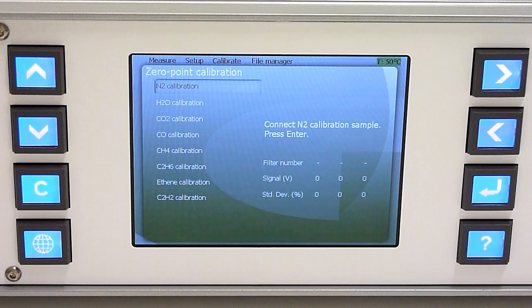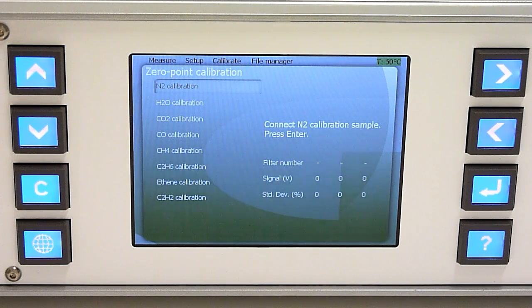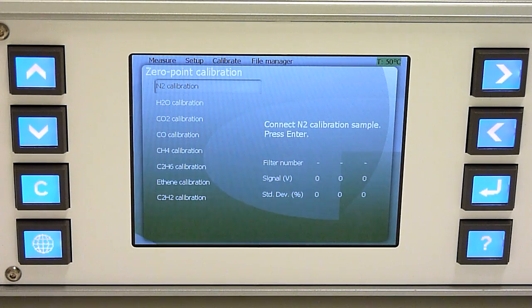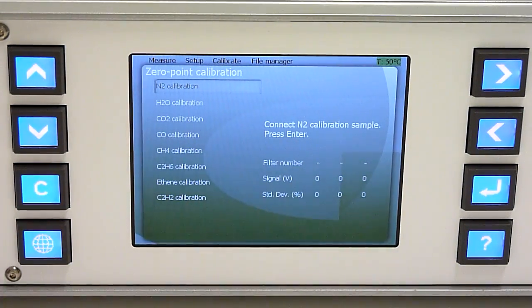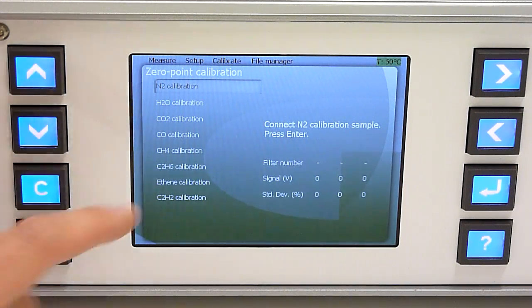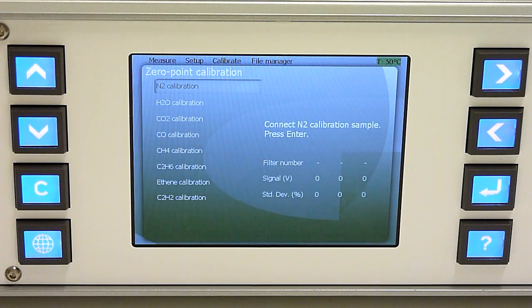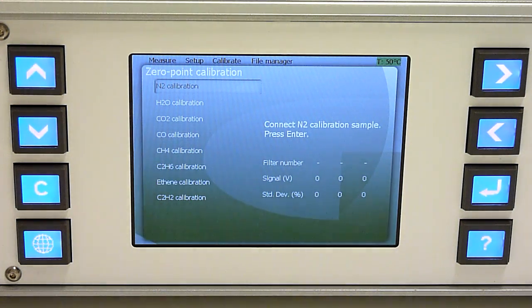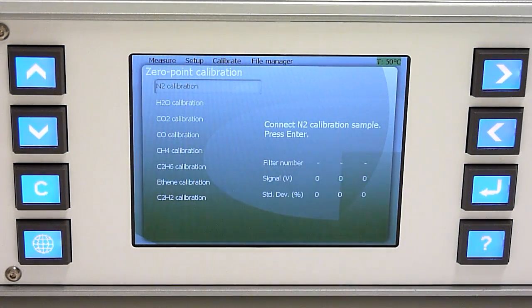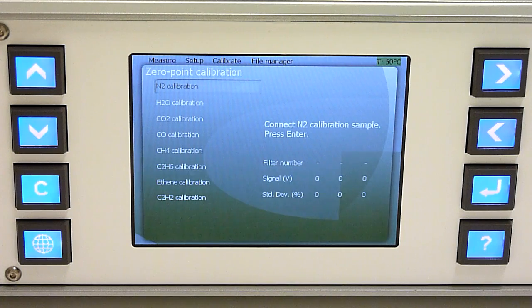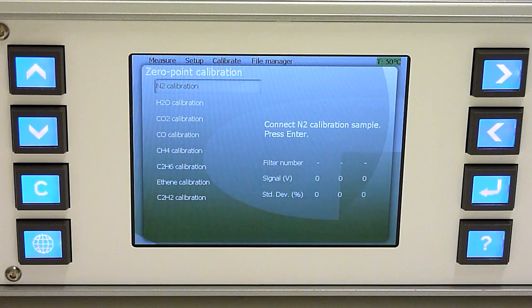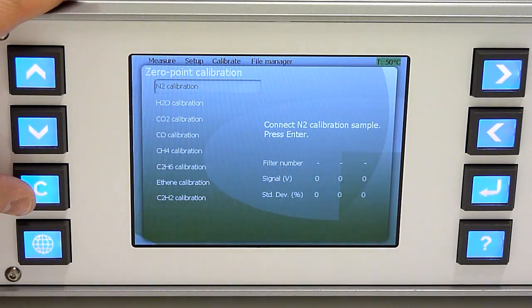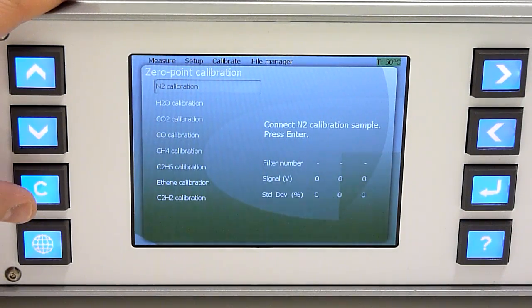When you do the calibration, the instrument guides you to connect the gas, asks you for the calibration concentration of different gases, and shows you the signal and the deviation of the signal during the calibration. Based on this information, you are able to decide when the sample has been completely flushed, when your gas cell is pure enough for the calibration, and when the instrument or the gas system is stable enough for the calibration. More details of the calibration and the features can be found in the user manual.